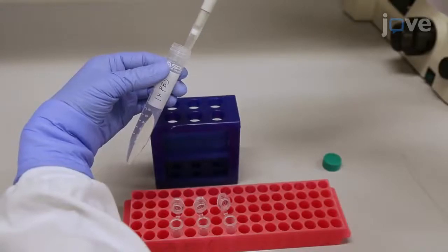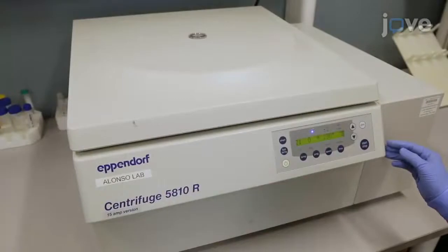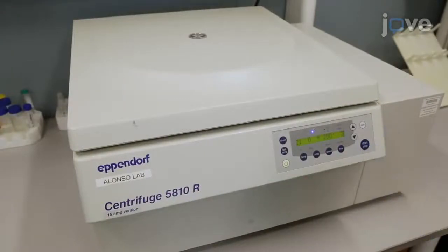Add 1-milliliter of PBS and centrifuge in a swinging bucket centrifuge until the speed reaches 200 times gravity and then stop the spin.